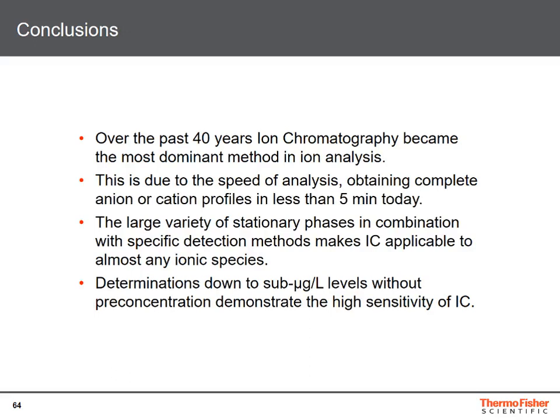We have a large variety of stationary phases in combination with many specific detection methods, and that makes, as I just pointed out, IC applicable to almost any ionic species. Determinations down to the sub-microgram per liter level without pre-concentration demonstrate the high sensitivity of ion chromatography today.